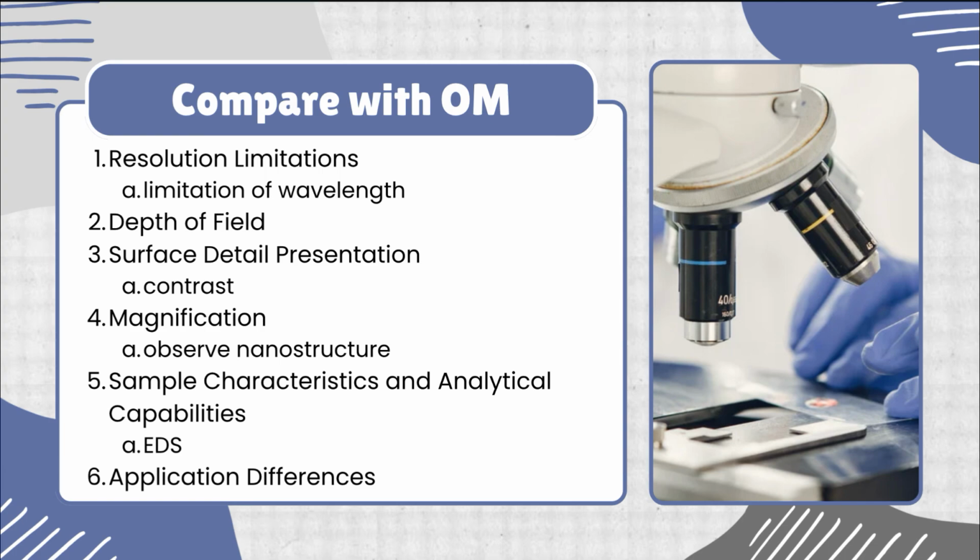And the fourth is magnification. OM has a maximum magnification of around 1000 times, which is insufficient for examining nanometer-scale structures. SEM offers magnifications up to several 100,000 times, enabling detailed observations of microscopic features.